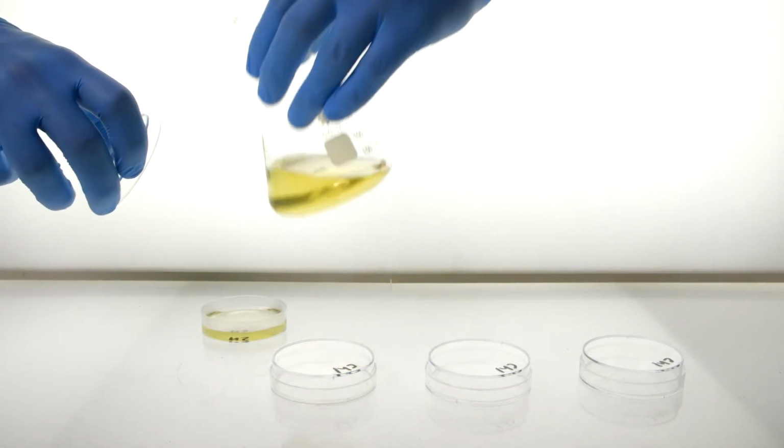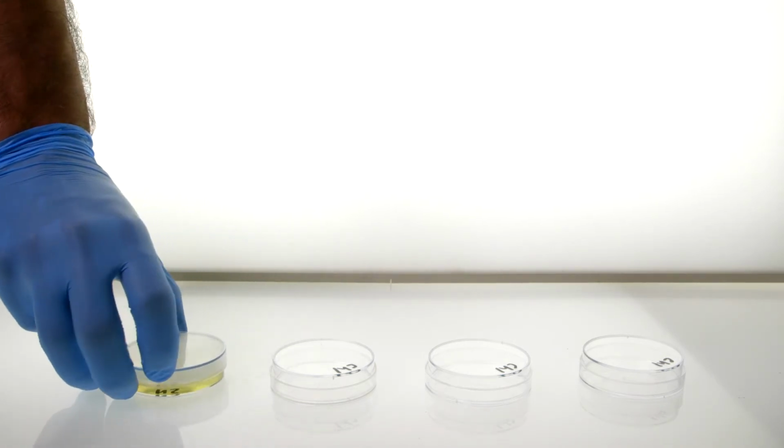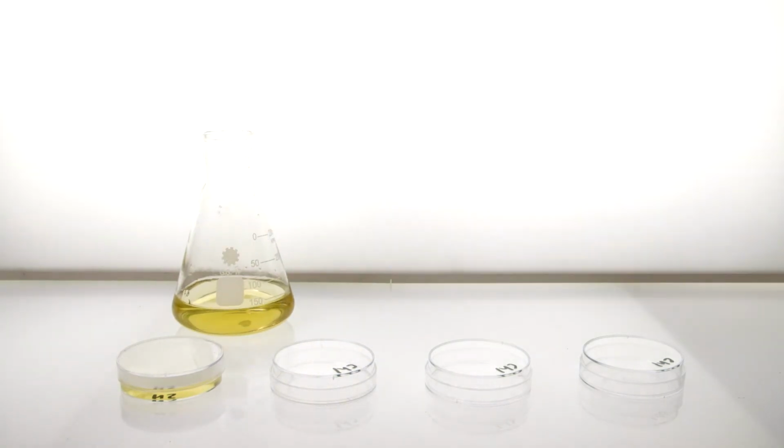Be careful that you're not creating bubbles or spilling. You'll need 1 non-selective plate per DNA design. After pouring, set the lids on the plates and let the agar solidify overnight. After you've poured your non-selective plates, you need to add antibiotics to the remaining agar.